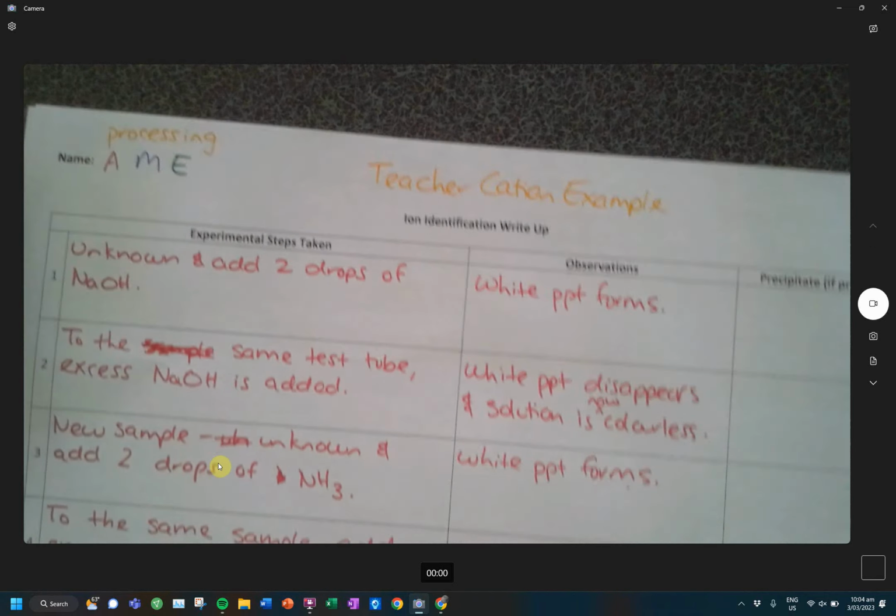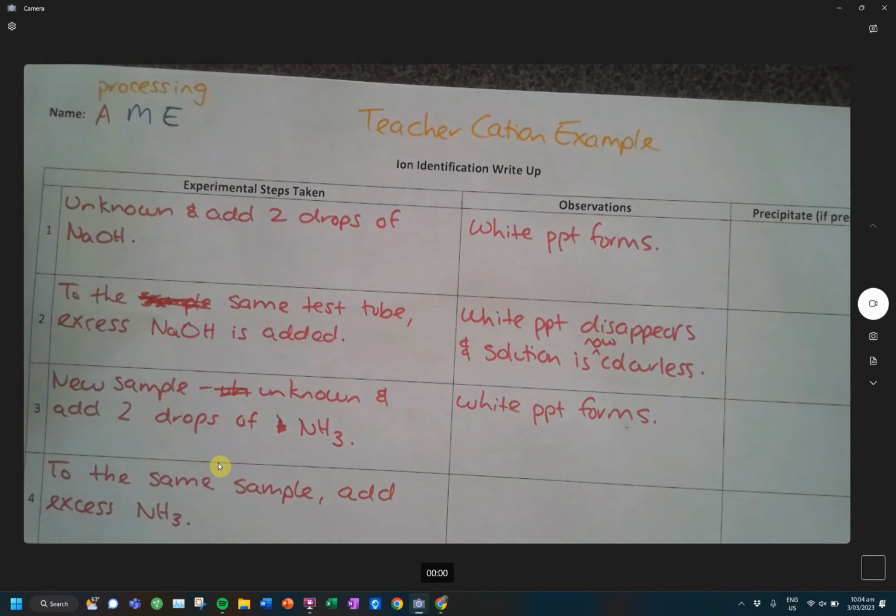If I want to double and triple check things, you are more than welcome to do things again. But the thing that I find really helpful to me is I go grab a pipette, and I just want to double check that I had the ratios correct, so that way I am actually diluting it. I'm going to grab a few because I want to show you guys what another precipitate would do, just so you guys know what you're looking for.